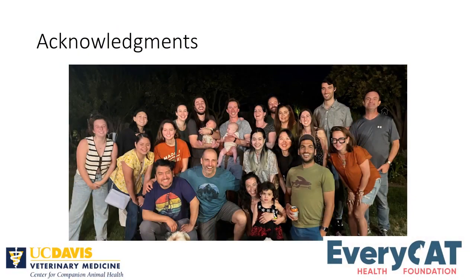All right. So today I'll be talking to you guys about a model that we've developed in the lab in the last few years, which is intestinal organoids. And in this body of work, we've used that in order to look at the potential direct effect of hyperglycemia on gut barrier function.